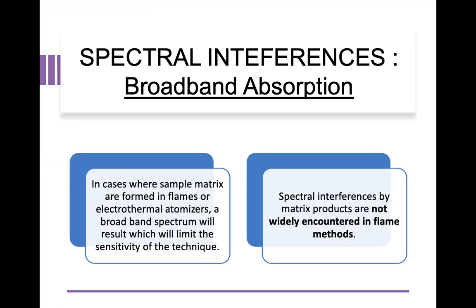Okay, broadband absorption is due to the inefficiency of the atomizers. Usually, when the sample is introduced, the atomization process is not in one shot.